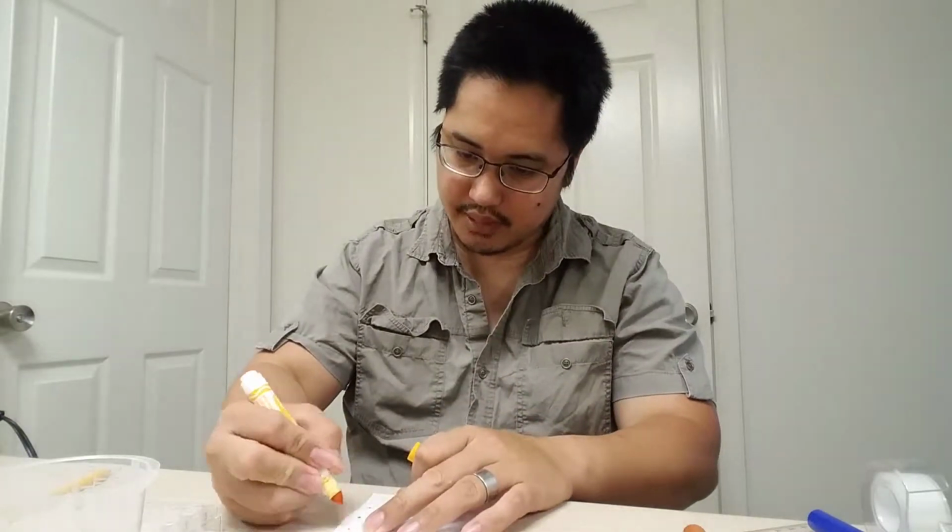So let's see. Put a dot of that on there. We'll try other things. I only brought markers with me, but you can try things like fruit juice or food coloring or other felt tip pens or vegetable juice, that kind of stuff. And the different colors actually make some interesting separations. Let's just go with the yellow here. I don't have a black felt tip marker with me today.